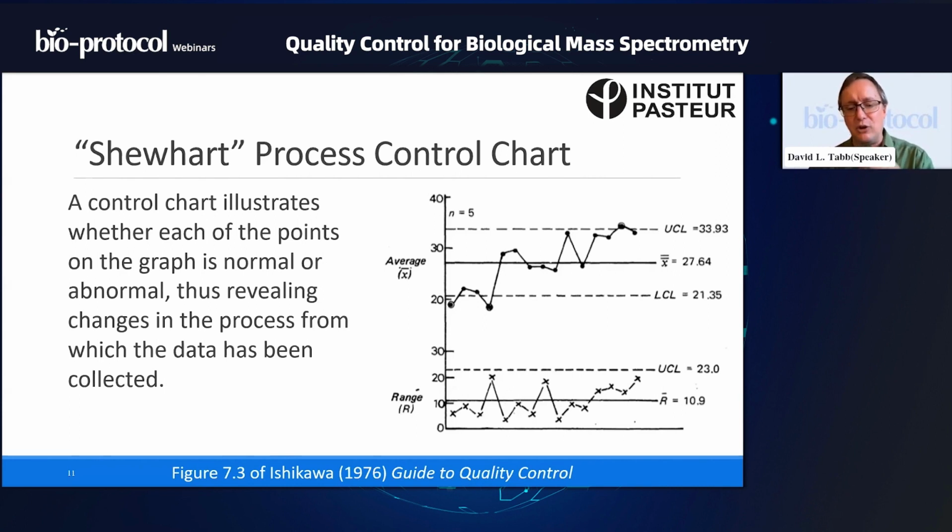Now at the bottom, I'm going to characterize something else. It might be that the 5 measurements I made of how many distinct peptides are in our QC sample gave very, very similar results, in which case the average is a very good representative of all 5. They group together very closely. They have a very narrow range. That would mean that they have a range close to 0.